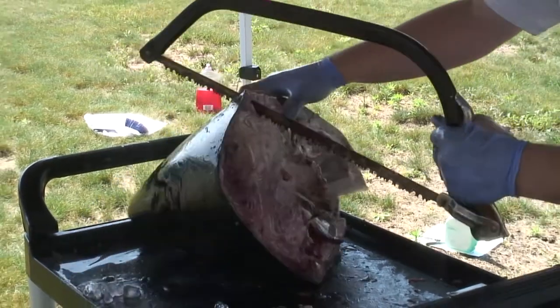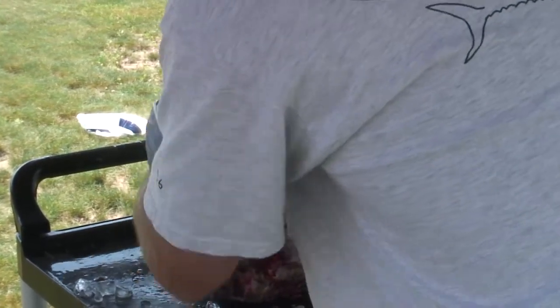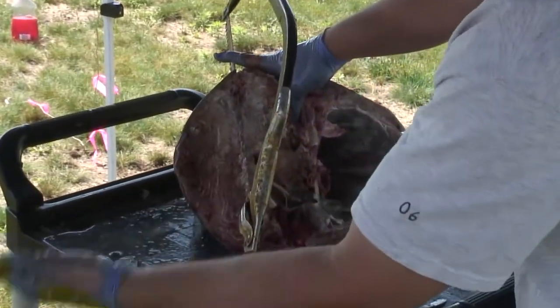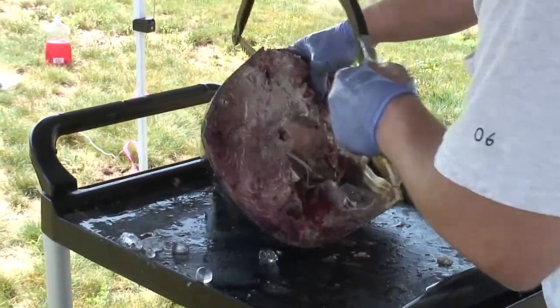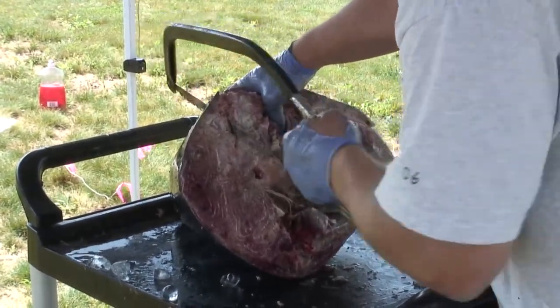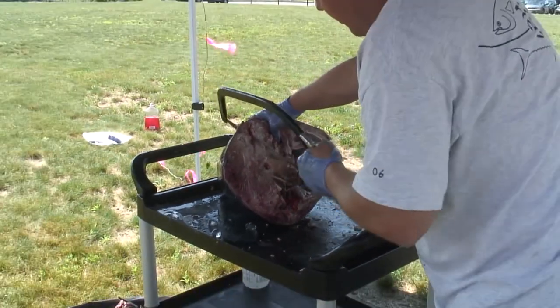You want to line it up. I'll see if I can go kind of to the side here. Just start off nice and easy. You kind of have to get that first cut right where you want it — it's a little awkward.